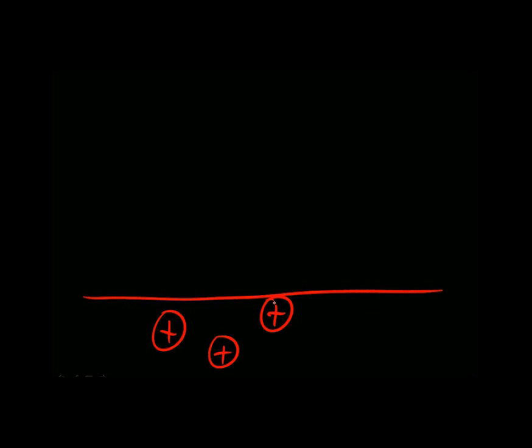Let's say this is our sample here, and we have different, these are the nuclei in the sample, right? And we're really concerned with the protons because the electrons won't interact with the neutrons in the nuclei of these sample atoms. And now let's say we have some incoming electrons from the electron beam. And what happens is many of these will kind of bounce off or be absorbed by the sample or be conducted away, or will cause different products to be produced.